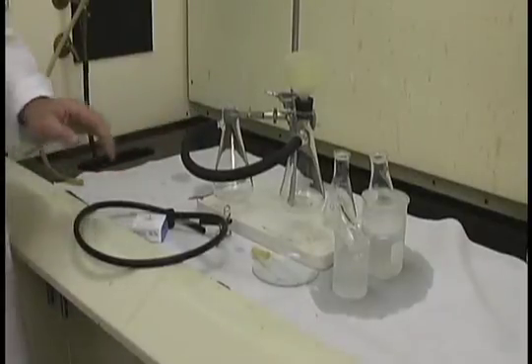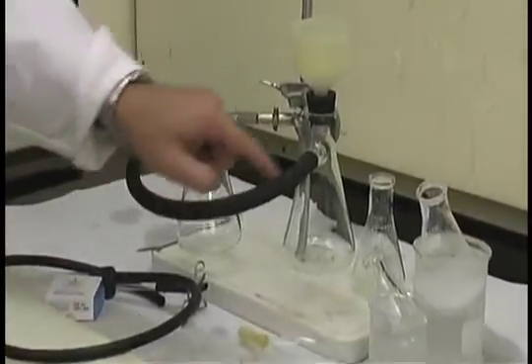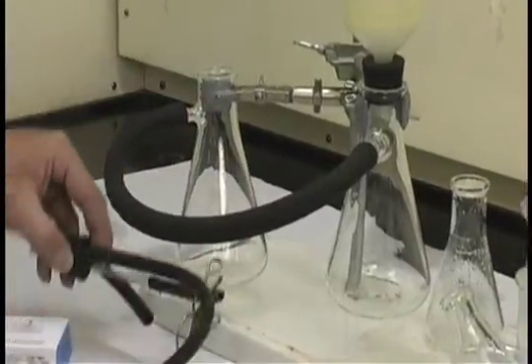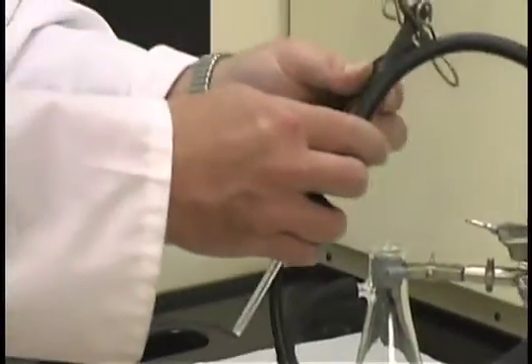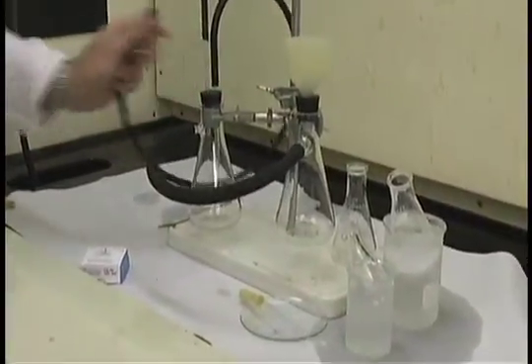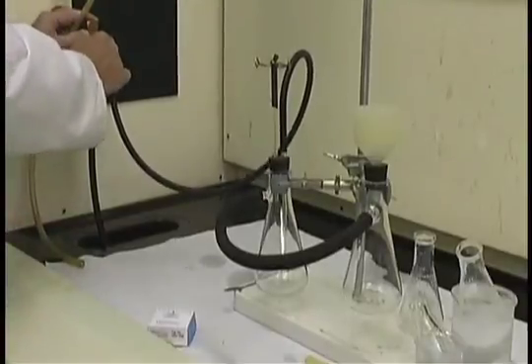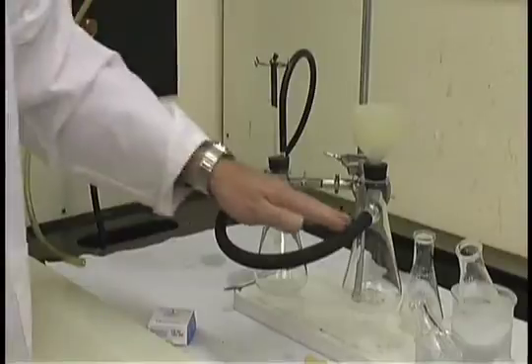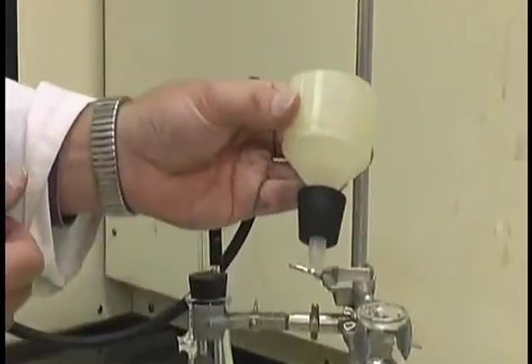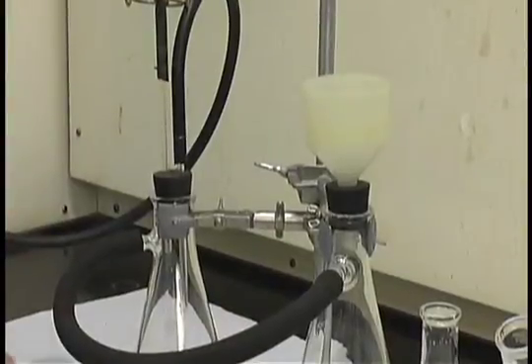In this system, the equipment that we need are two 250 mL sidearm flasks. The sidearm flasks are connected together by a short piece of vacuum tubing. We also have another set of tubing that is connected to a stopper, which is then placed into the mouth of the other funnel and attached to an aspirator. The other flask is fitted with a Buechner funnel, which has a rubber stopper or an adapter allowing it to fit snugly into the sidearm flask.